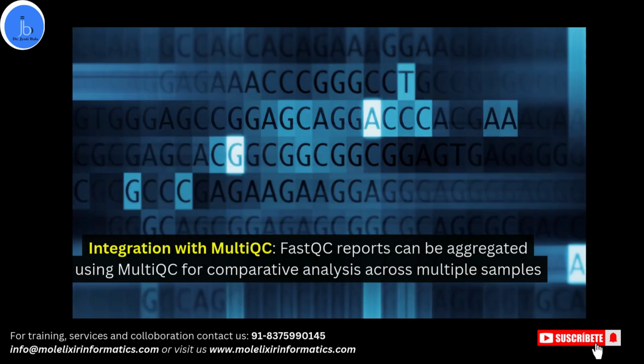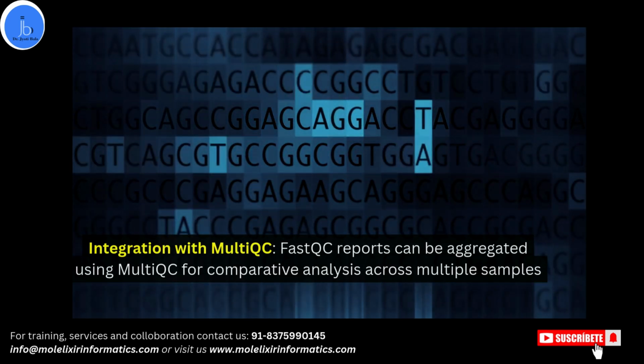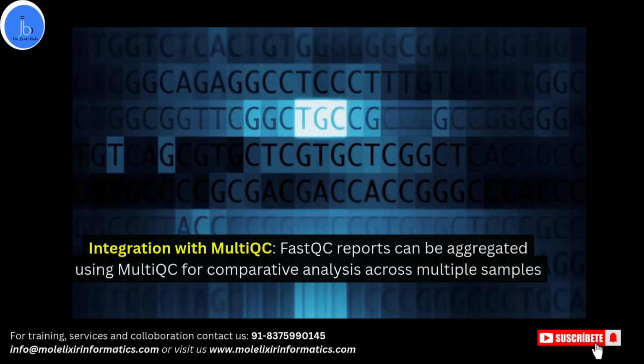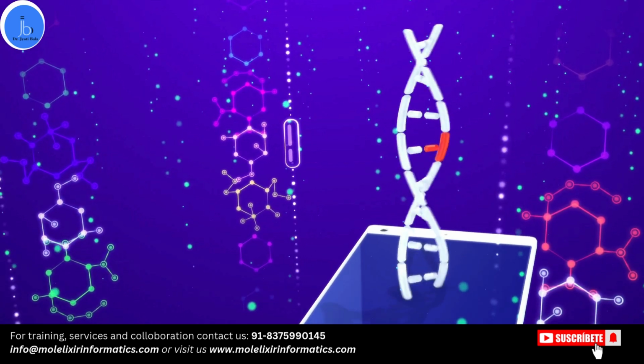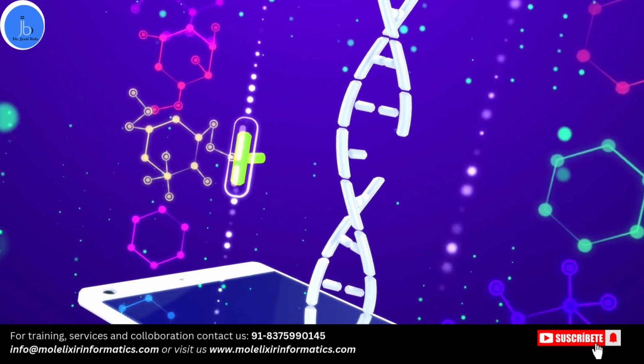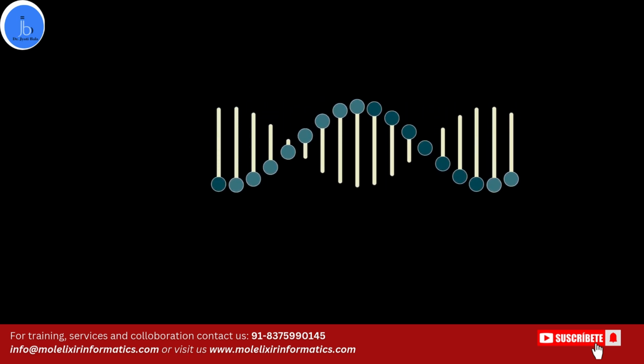It also supports integration with MultiQC. FastQC reports can be aggregated using MultiQC for comparative analysis across multiple samples. So you can say it has a user-friendly interface which provides fast processing of large data sets and also compatibility with diverse sequencing technologies like Illumina and PacBio.